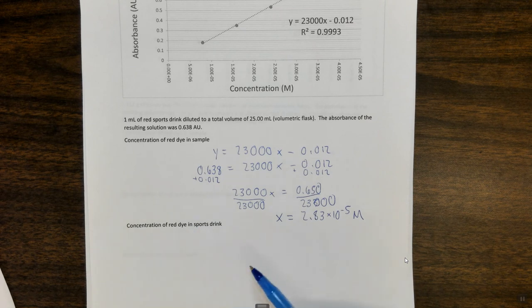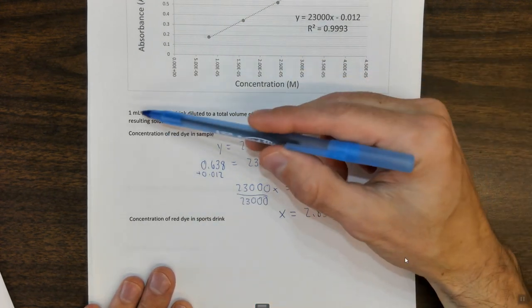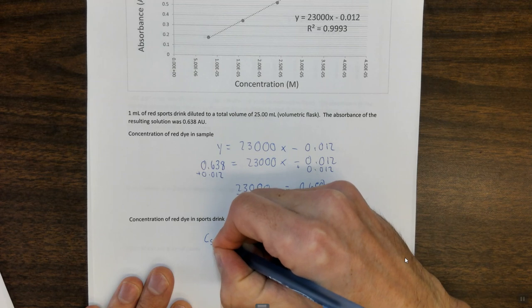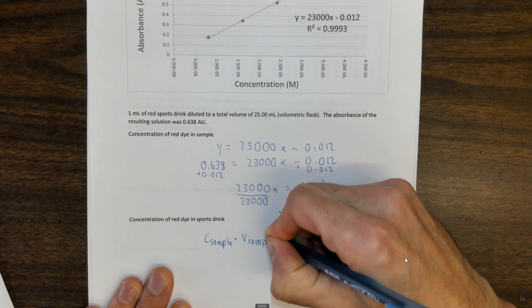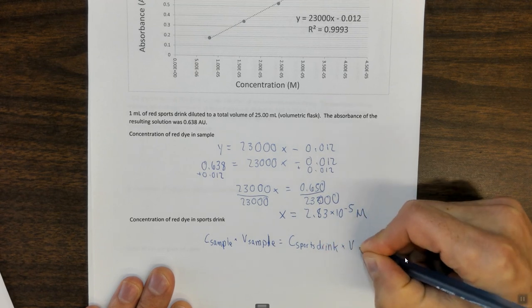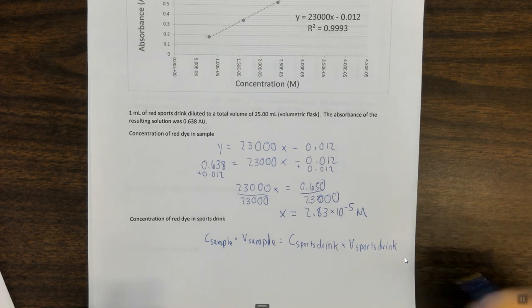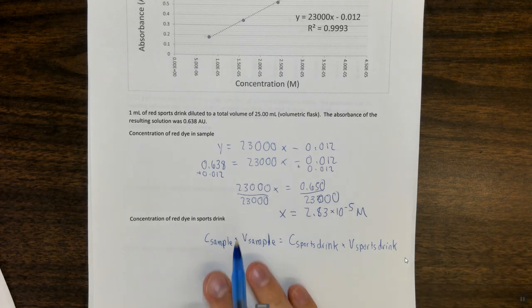Now I want to find the concentration of red dye in the sports drink. So in order to do this, I'm essentially going to use C1V1 equals C2V2, but I'm going to use a slightly modified version. I'm going to call it the sample, that's the 1 to 25 dilution, and the sports drink. So C sample times V sample equals C sports drink times V sports drink, because I diluted the sports drink. So I can use the dilution equation. It's the same as C1V1 equals C2V2. I just changed the titles here.